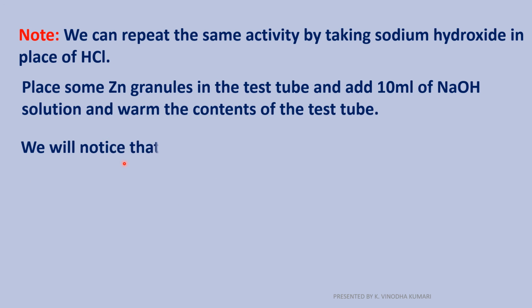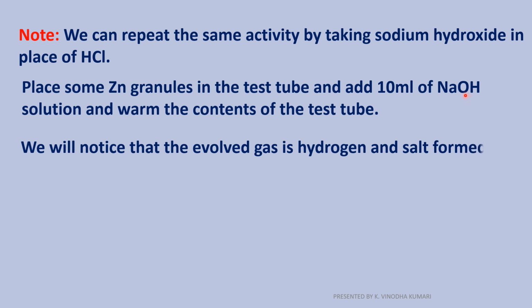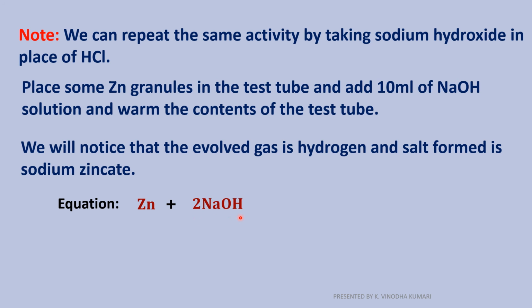We will notice that hydrogen gas is evolved by the reaction between the sodium hydroxide solution and the zinc granules, and the salt formed will be sodium zincate. We'll write the equation. Zinc plus sodium hydroxide gives rise to the salt sodium zincate, Na2ZnO2, and then hydrogen gas.